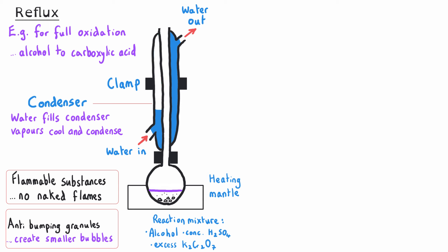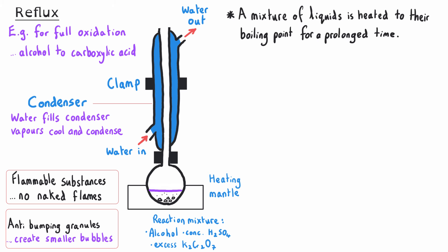If the water went in at the top and out at the bottom, the condenser wouldn't fill properly, so the vapors wouldn't cool as quickly and might escape. This could be potentially hazardous and would certainly decrease our yield. When we carry out a reflux, we take our mixture of liquids and heat them at their boiling points for a prolonged period of time.